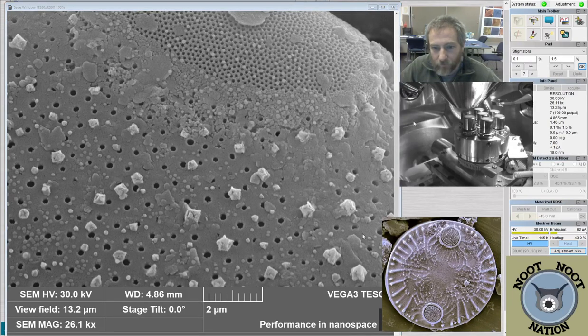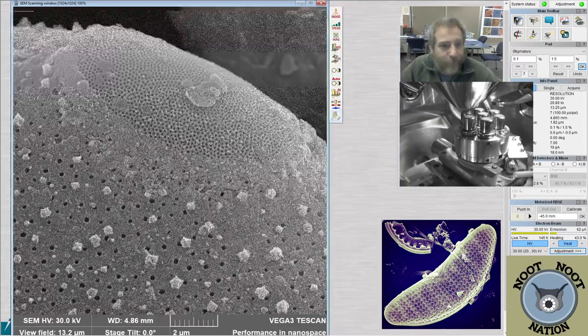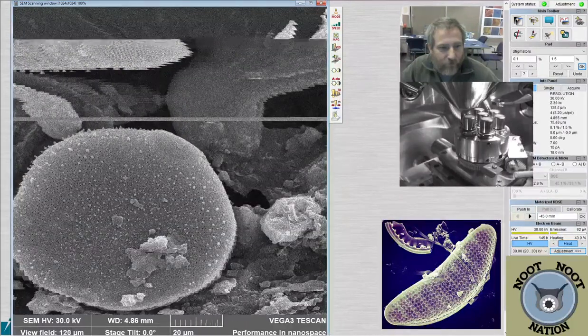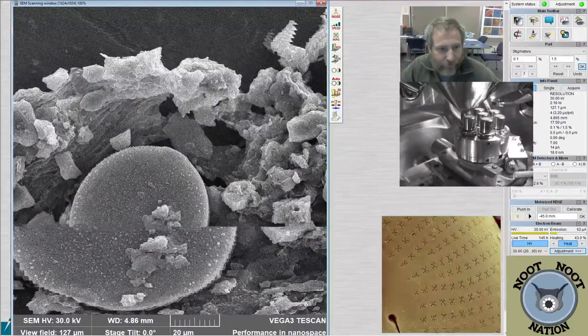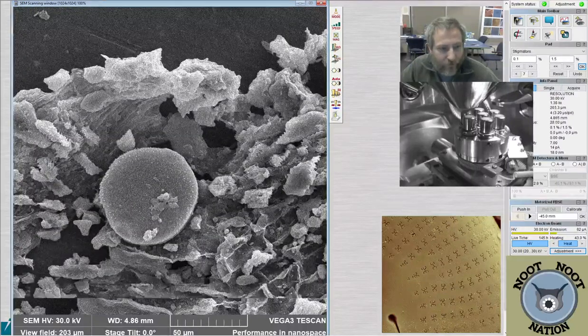That's good. This is an ocellus, there's just one. And then I'm going to zoom out. We'll try to find something else. So we'll leave behind our Pleurosira friend here and see what else we can find in our material.